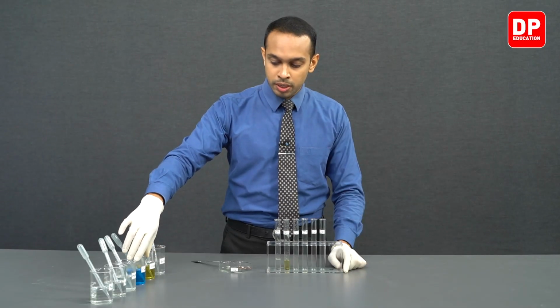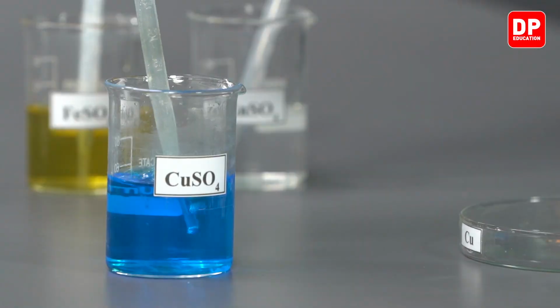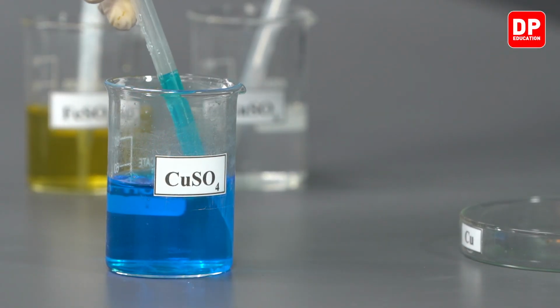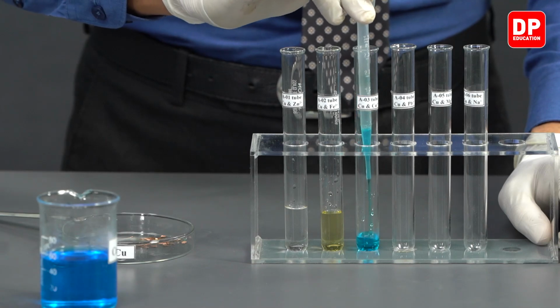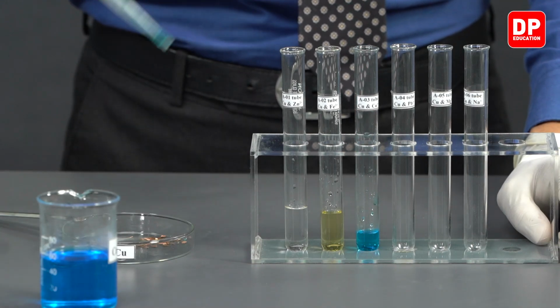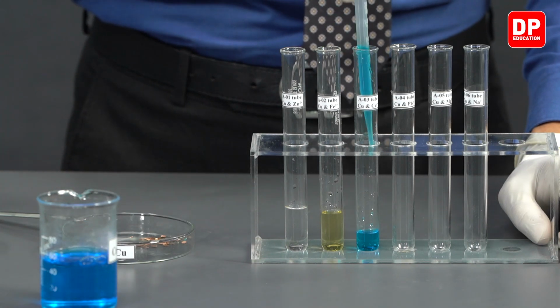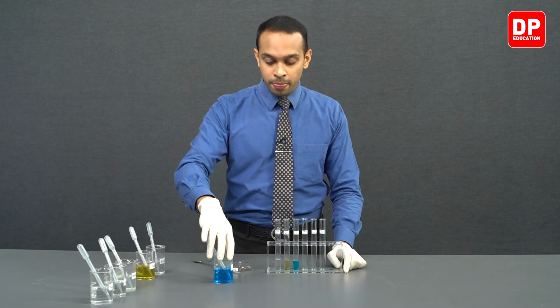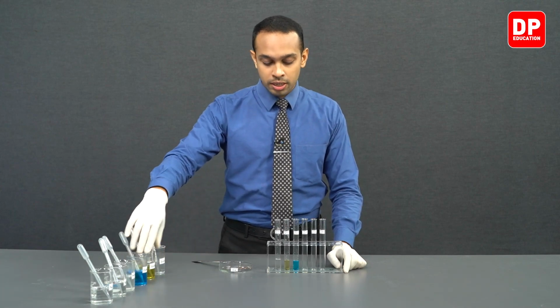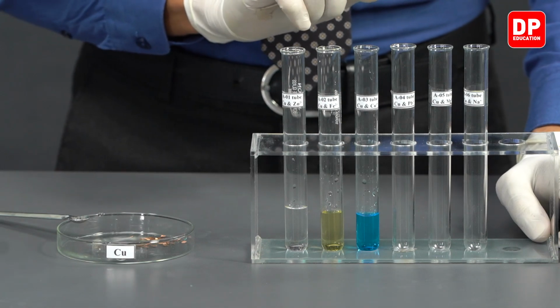And then to obtain copper 2+ ions, we use our copper sulfate solution. As you can observe, copper sulfate solution is a blue color. And to the test tube labeled copper 2+ ions, we are going to add around 5 milliliters of copper sulfate solution into the test tube labeled Cu2+ ions.